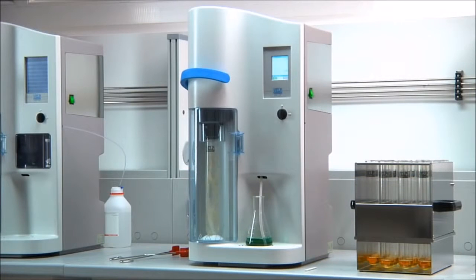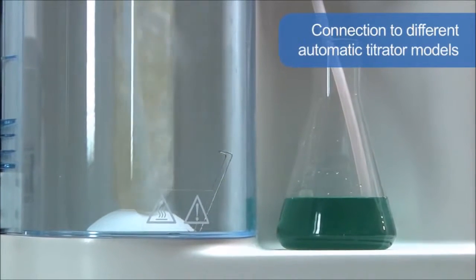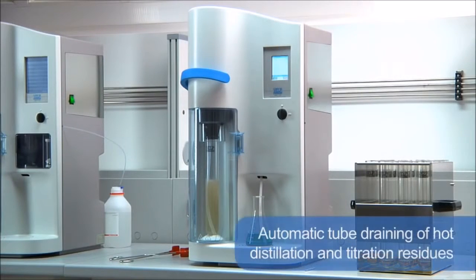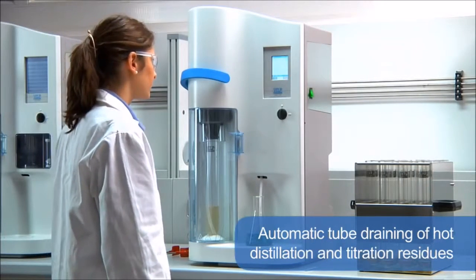The UDK 149 offers connection to different automatic titrator models and enables the final result to be obtained directly. Automatic tube draining of hot distillation and titration residues increases operator safety, saving time and reducing manual activities.